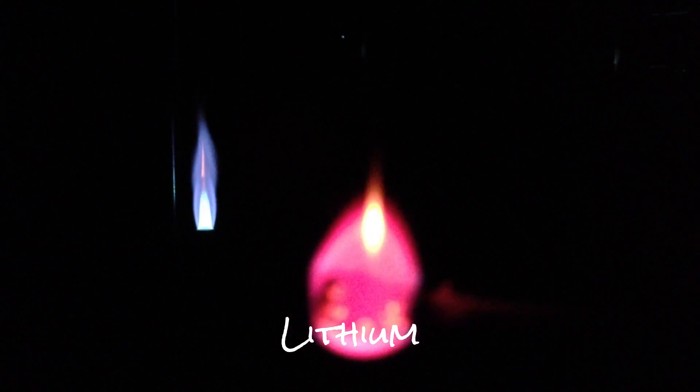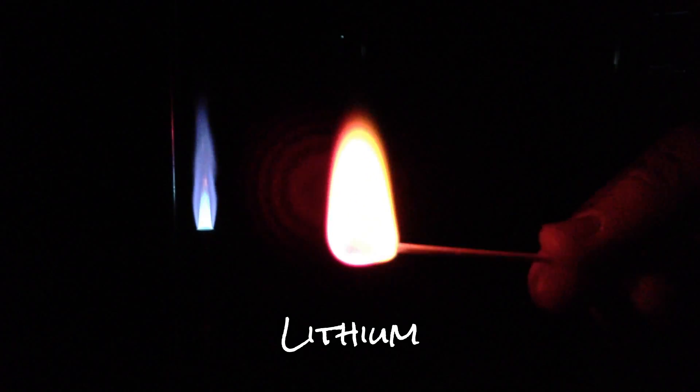And then we're going to end with lithium. Same idea — soak it in methanol and dip some lithium ions on here. These are ions of metals, but they work the same; they are a little different from the atoms, but essentially the transitions are very similar. Let me try this again — I didn't have quite enough methanol. Now I've got more than enough — here's my lithium. There we go. Very pretty lithium, and that's the flame test for lithium.